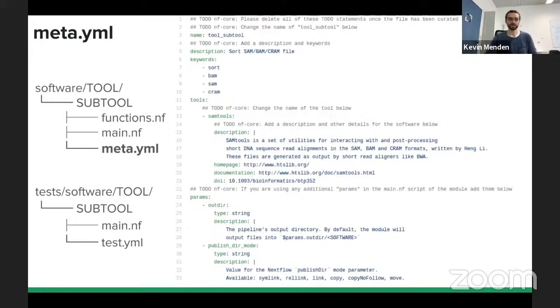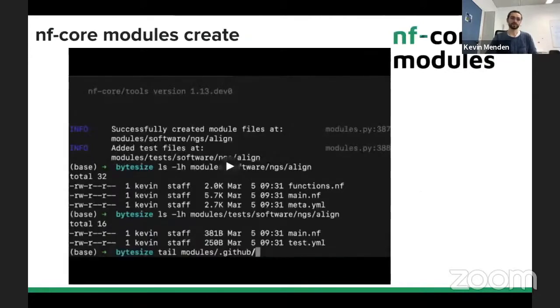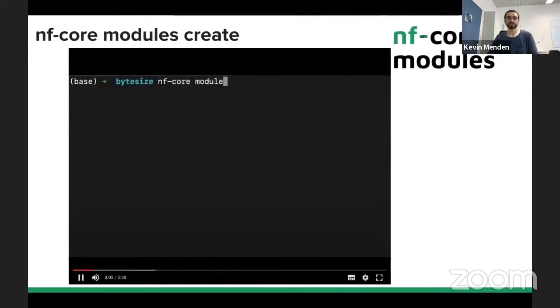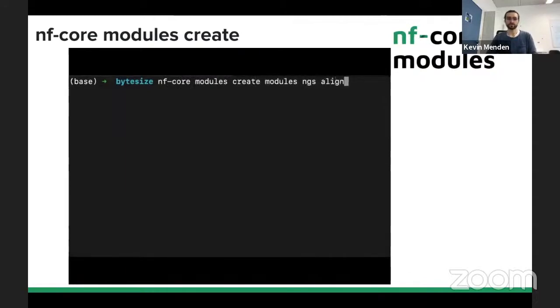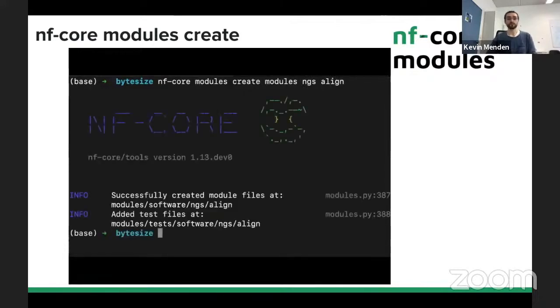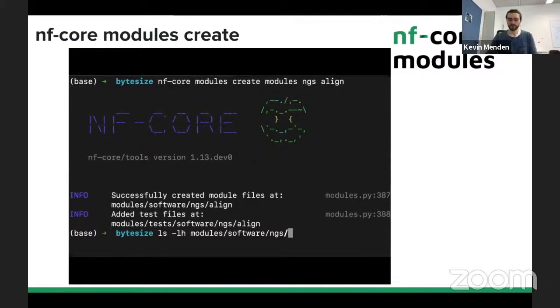Instead of copying them, you can use the NFCore modules create command. You just type NFCore modules create, point it to the modules directory, and then type in the name of your module. This will create the directory and all the files you need. In this case, we have the NGS tool with the sub-tool align, and it creates all the main files, the test files with the module name already in there, and also appends a few lines to the filters.yaml file so that your tests are run once you have them written out.